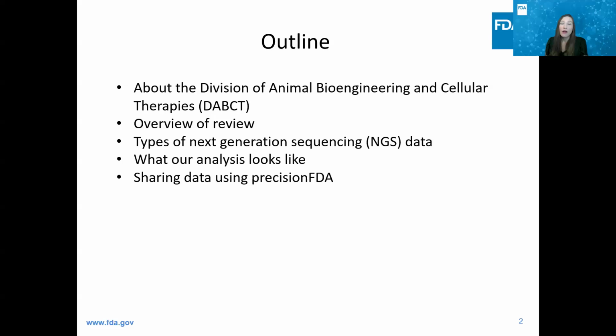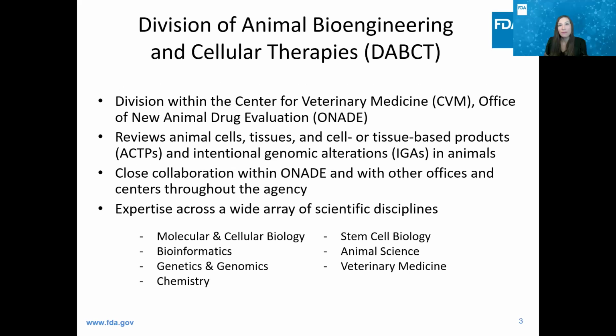Our agenda today will cover information about the Division of Animal Bioengineering and Cellular Therapies, abbreviated DABCT, an overview of the review, an overview of the common types of NGS data, an overview of what our analysis looks like, and finally, the process for sharing data using precisionFDA.